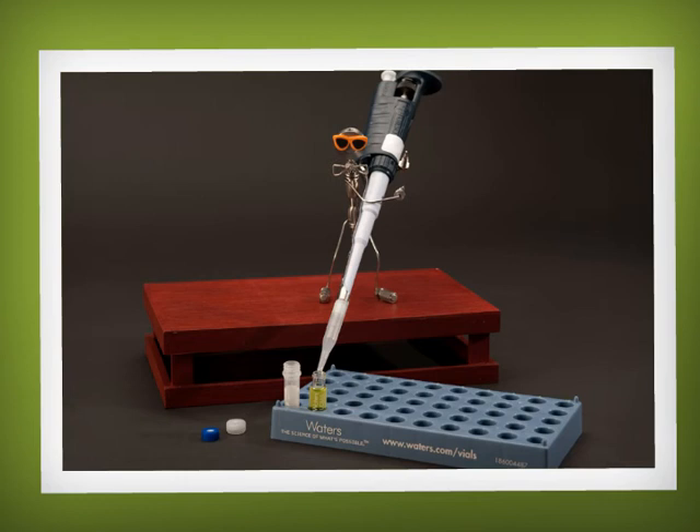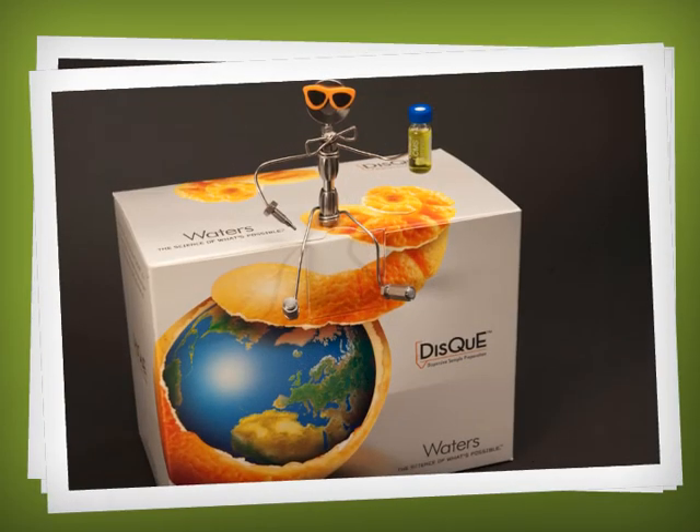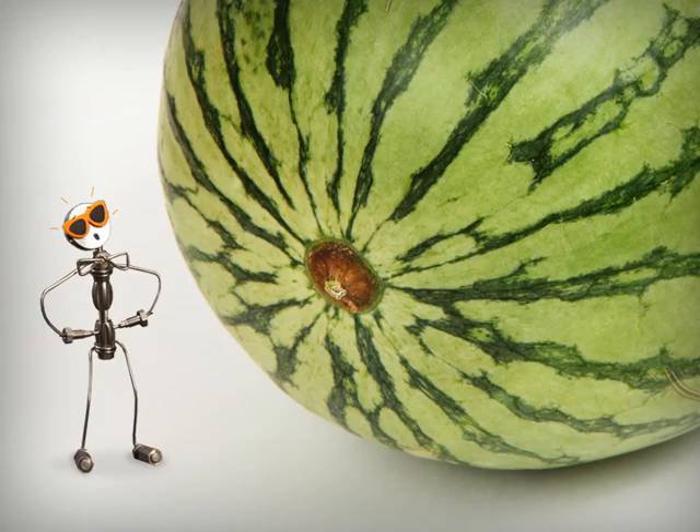It's time to centrifuge Tube 2. We're almost done — transfer the final extract from Tube 2 to an autosampler vial for LC or GC analysis. See, I told you it was easy!